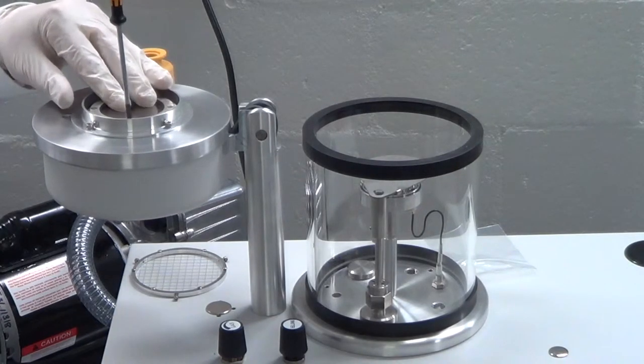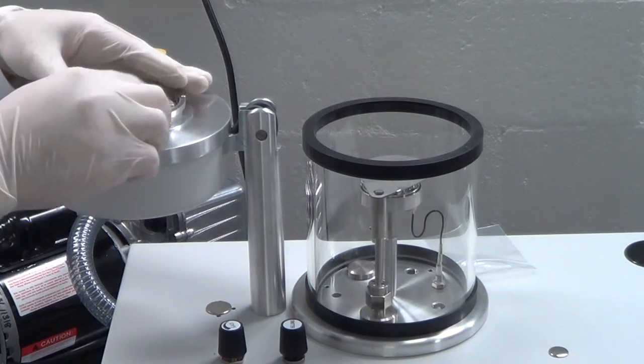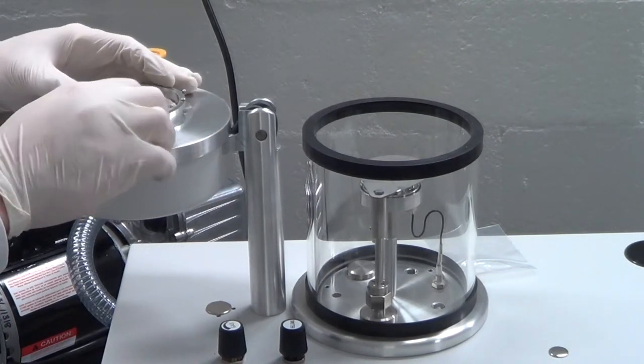Once you are satisfied with the placement of the target, tighten the four screws. Reattach the grid with the thumb screws and close the lid.